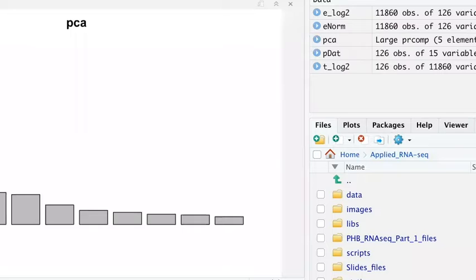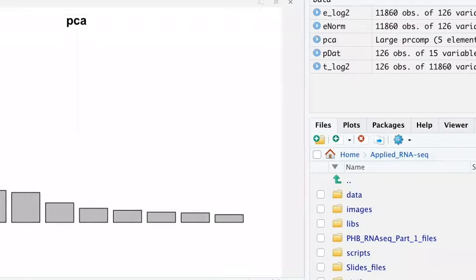Now, it's okay. It shows us the basic thing. PC1 has the highest variance, PC2 lower, and then you get a tail around here. So this is kind of where we start to plateau off. So I would say that PC1, 2, 3, 4, 5, 6, 7, up until PC7 is when I see the most variation within our samples before it tapers off or plateaus. So I won't consider those later PCs for my analysis further down if I wanted to include my principal components.